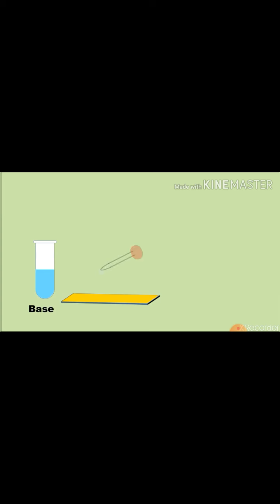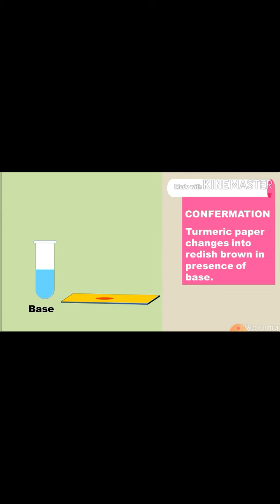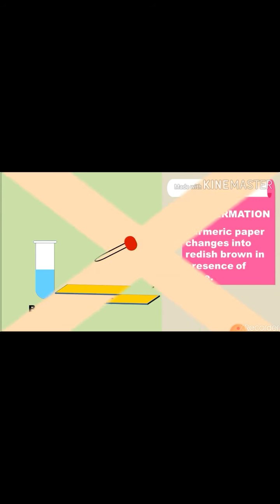Let's see how turmeric paper can be used as an indicator for base. Take few drops of base in a dropper and pour some drops of base on turmeric paper. You will observe that the yellow color of turmeric paper will change into reddish brown, which indicates the presence of base. Turmeric paper changes into reddish brown in presence of base.